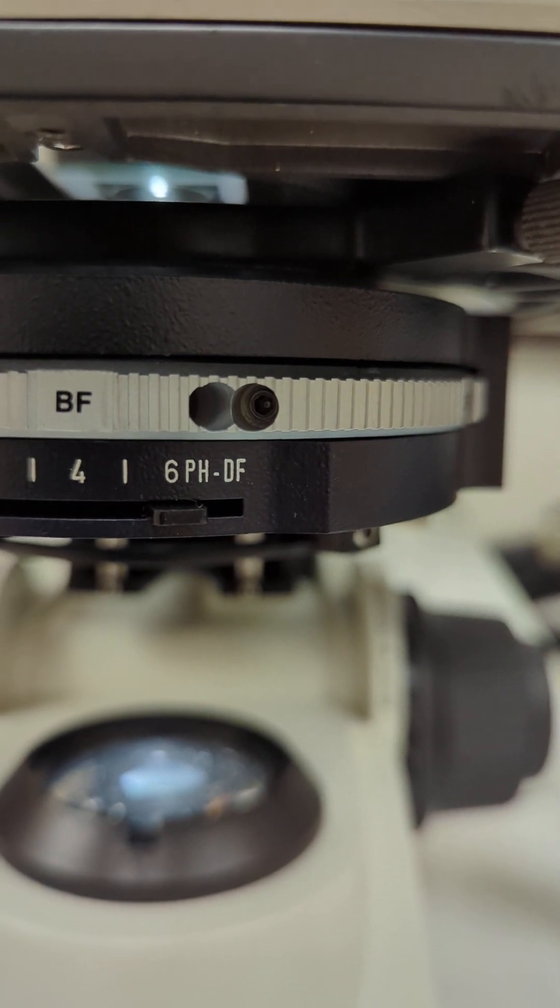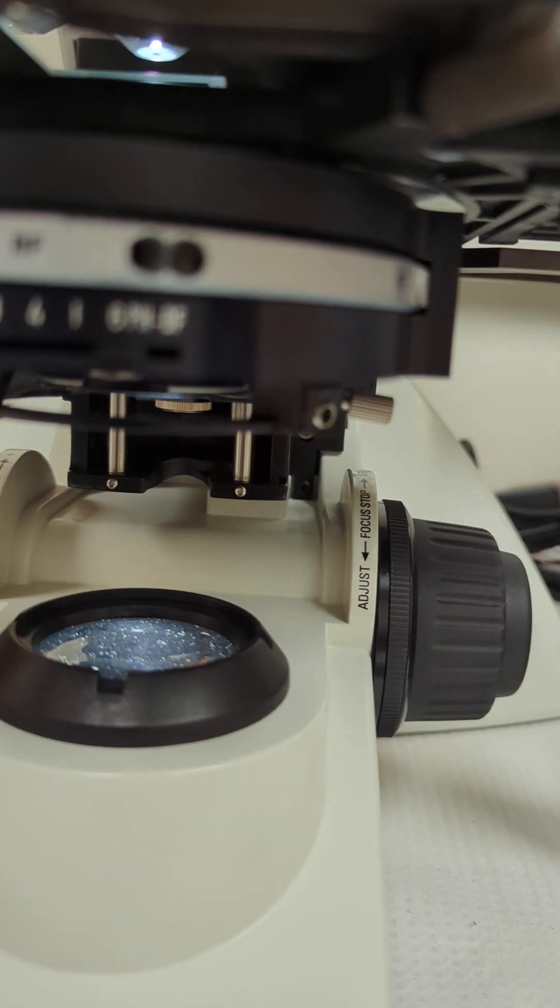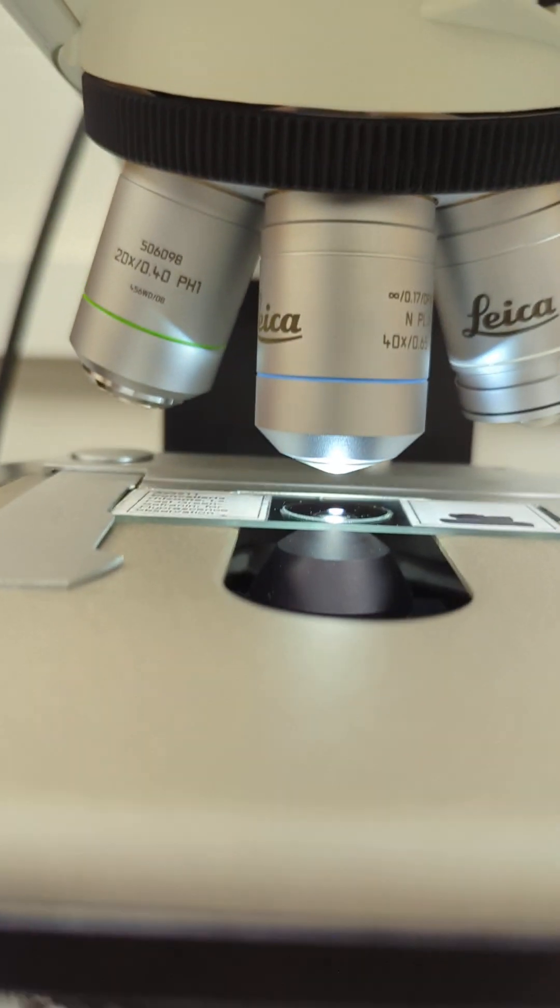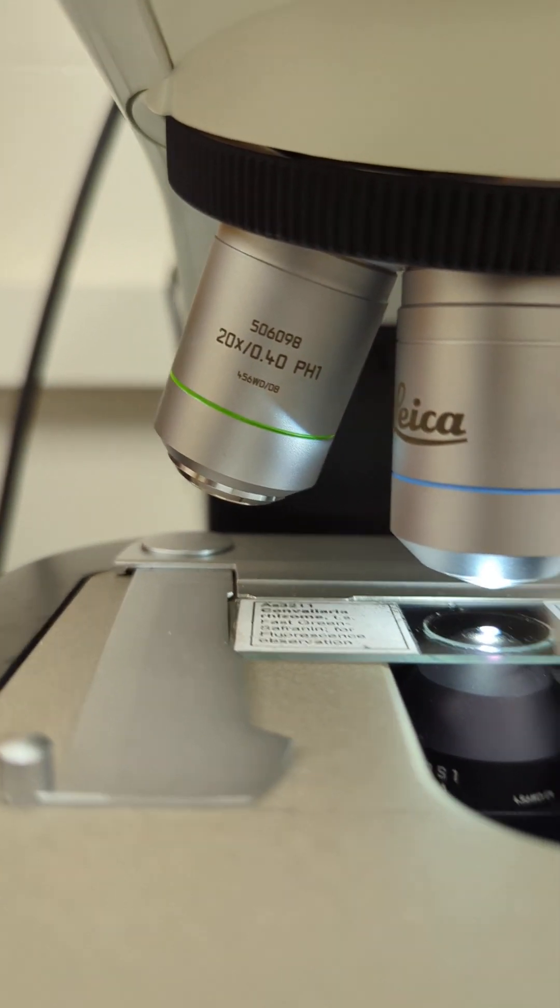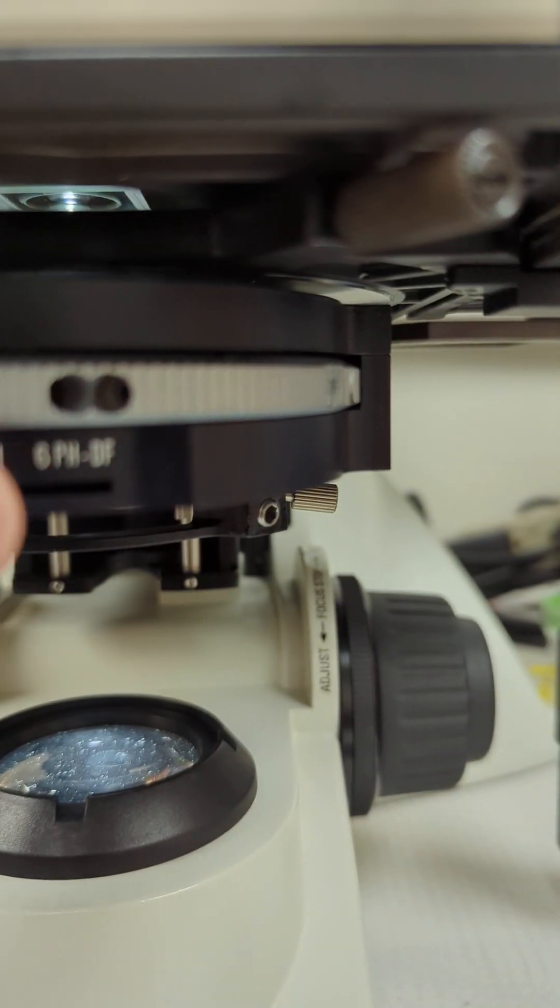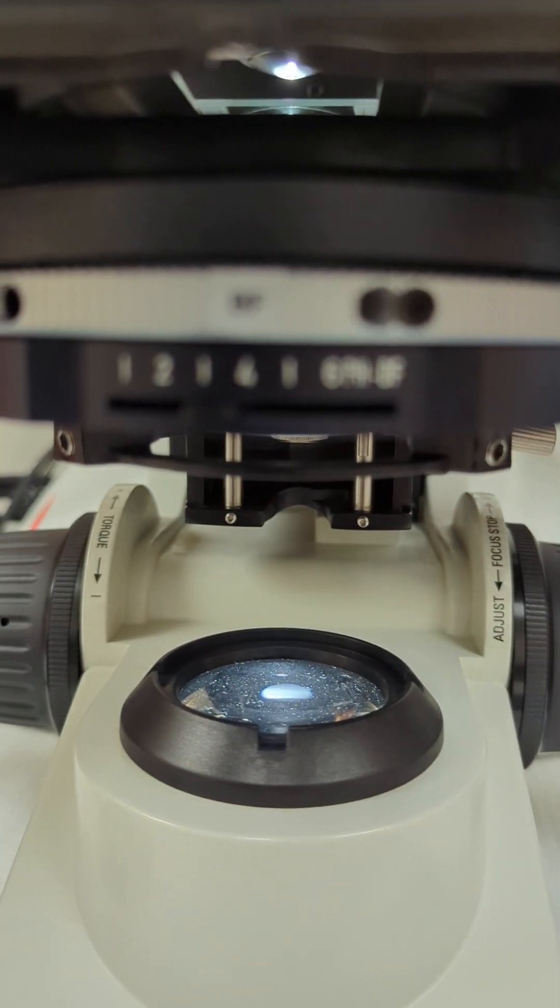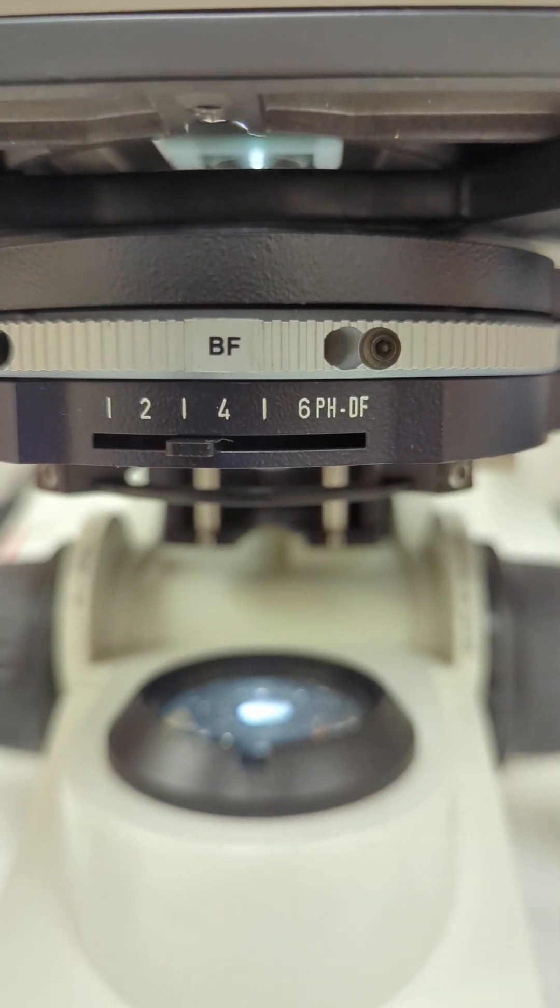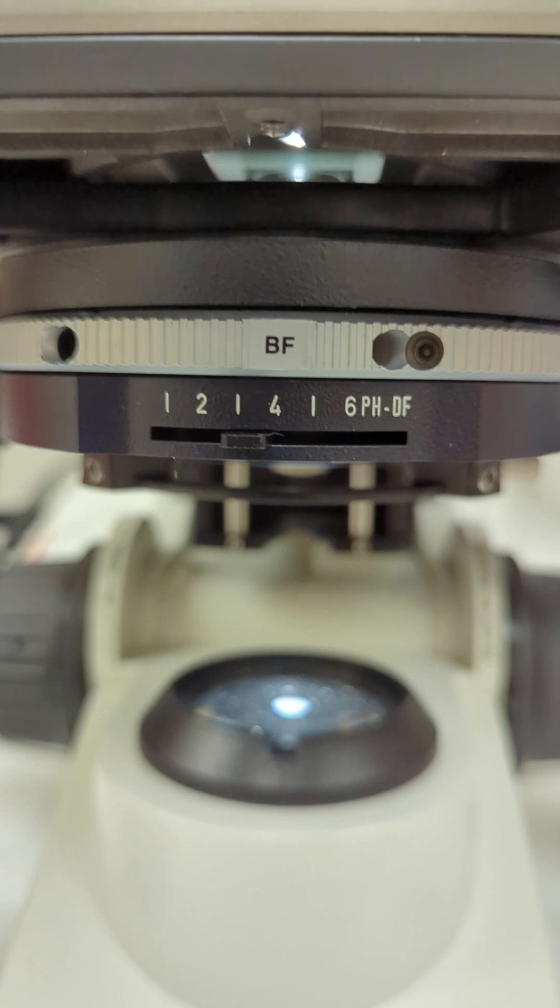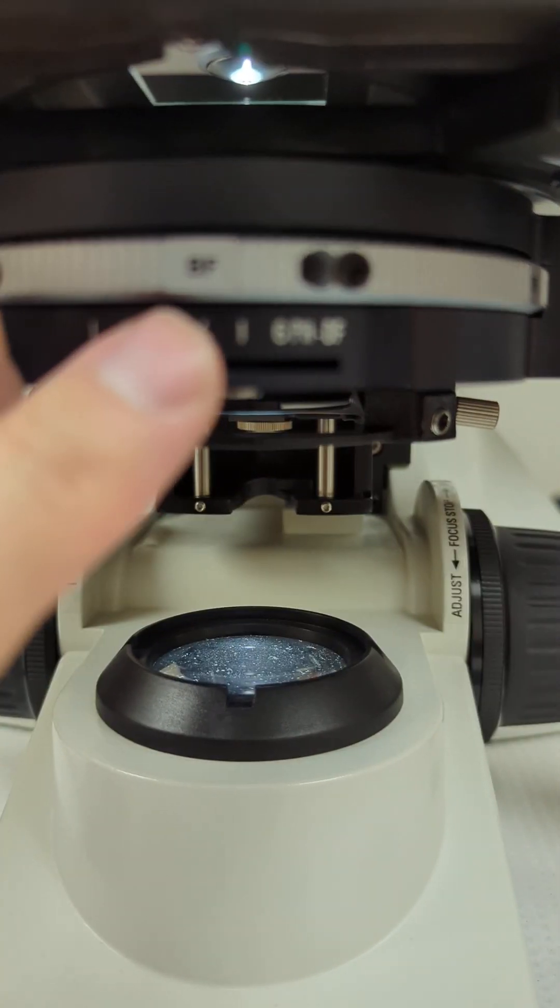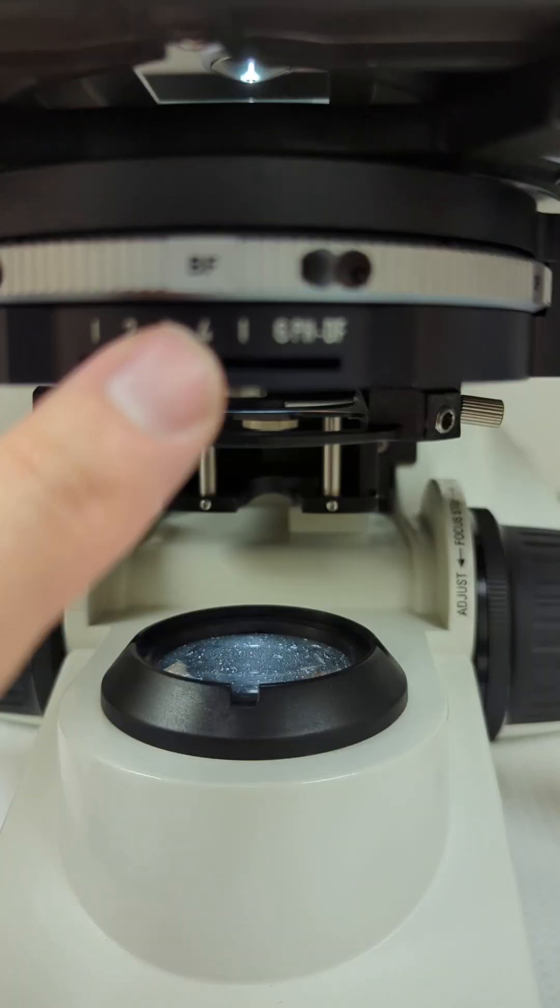0.65 means I would move this to close to six. And if I was on the 20, it's a 0.4, 20x, 0.4, so I would move this to the four.